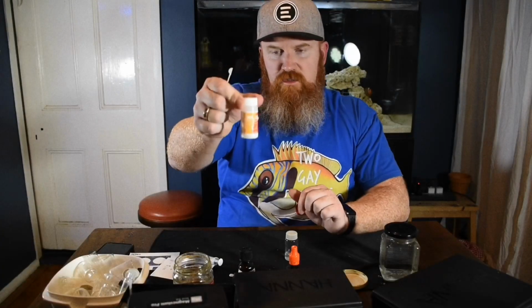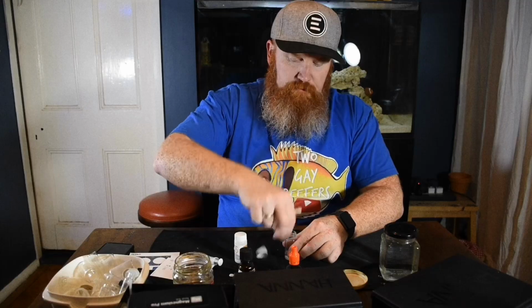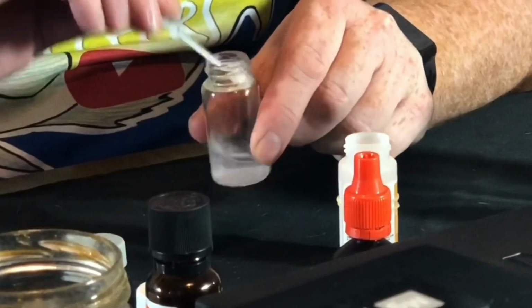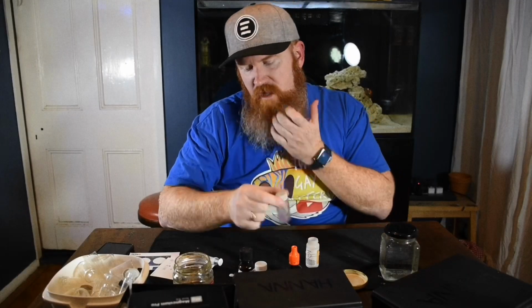Next you get your reagent C. Once again, one level scoop. And the key is to make sure it's a level scoop, not a mounded scoop or anything like that. Give it a shake for 10 seconds.